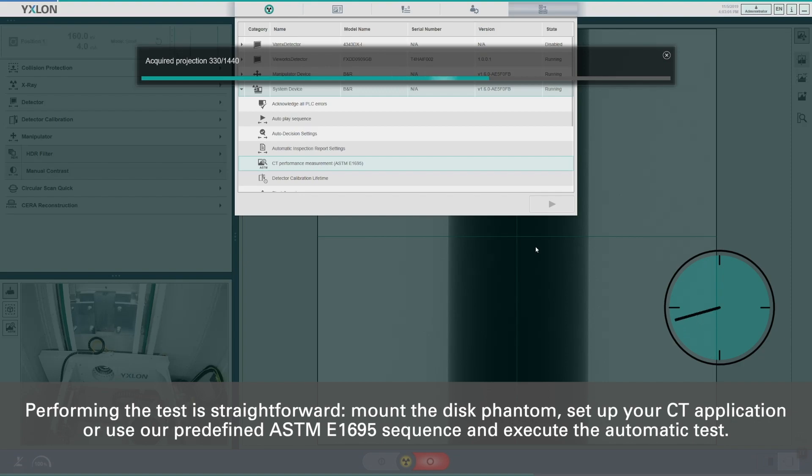Mount the disk phantom, set up your CT application or use our predefined E1695 sequence and execute the automatic test.